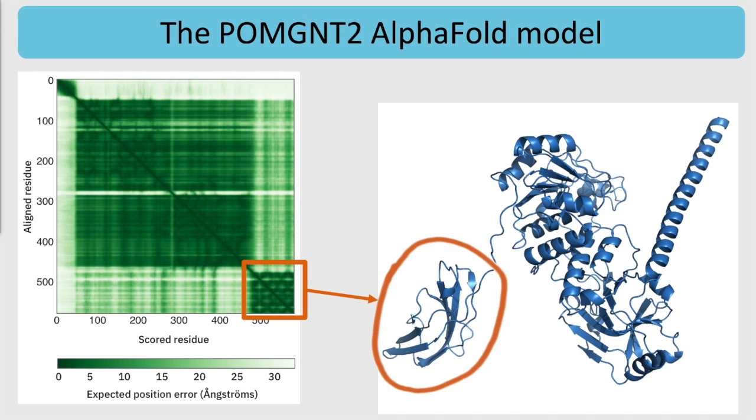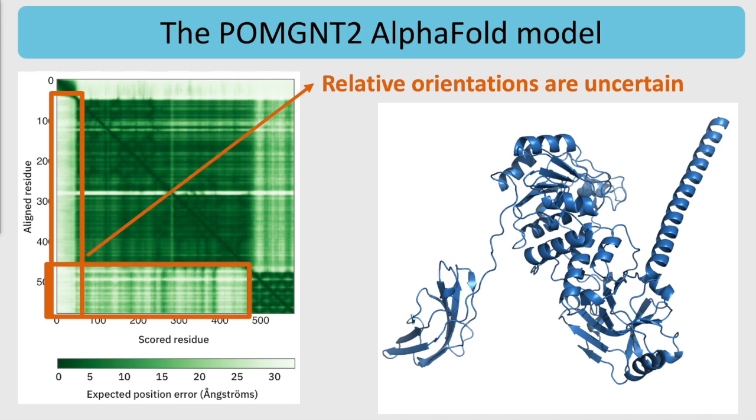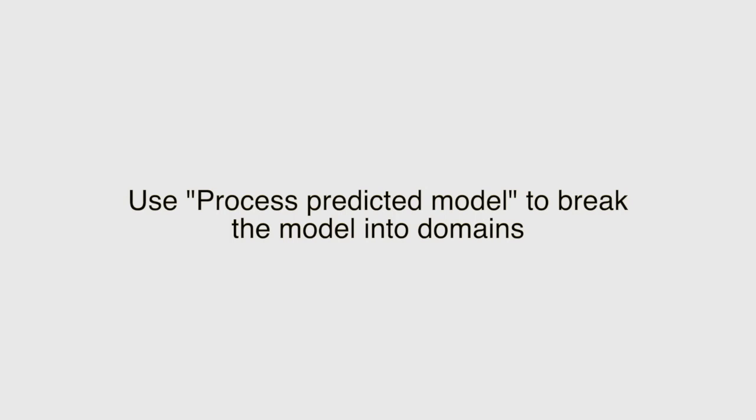The light green areas away from the diagonal in the plot suggest that the relative orientations of the domains are uncertain. So before doing molecular replacement, we will use the process predicted model tool to break the model into domains.